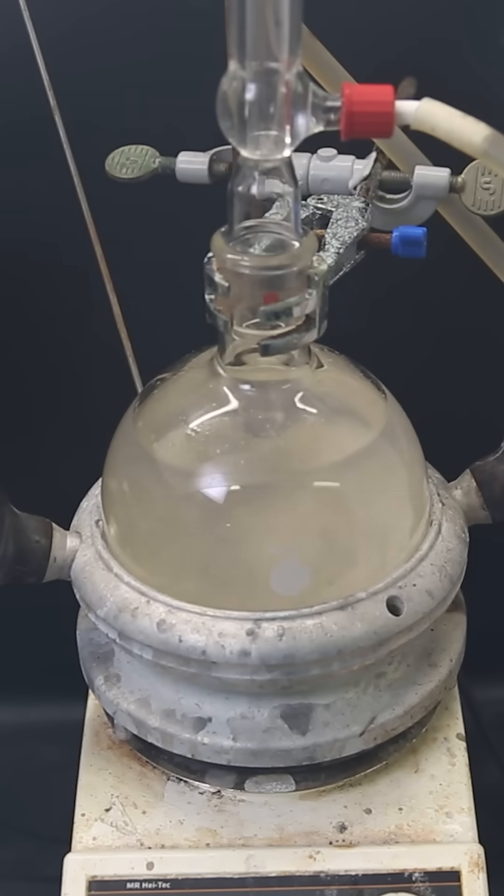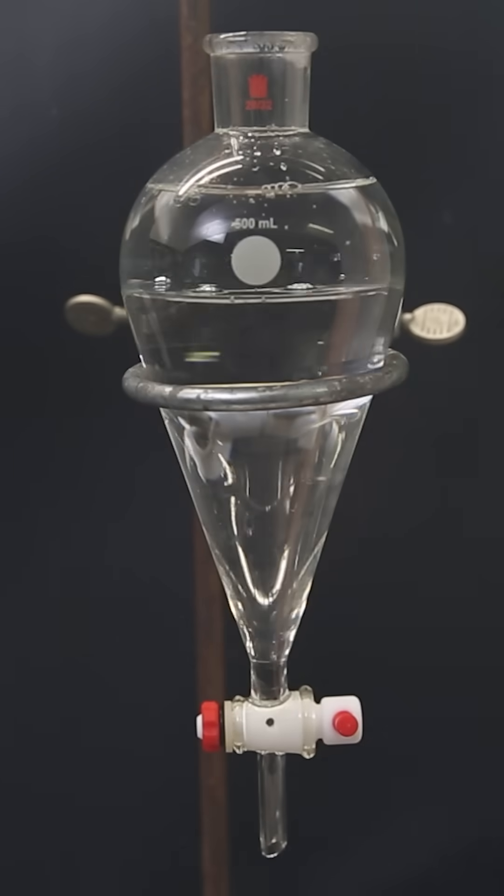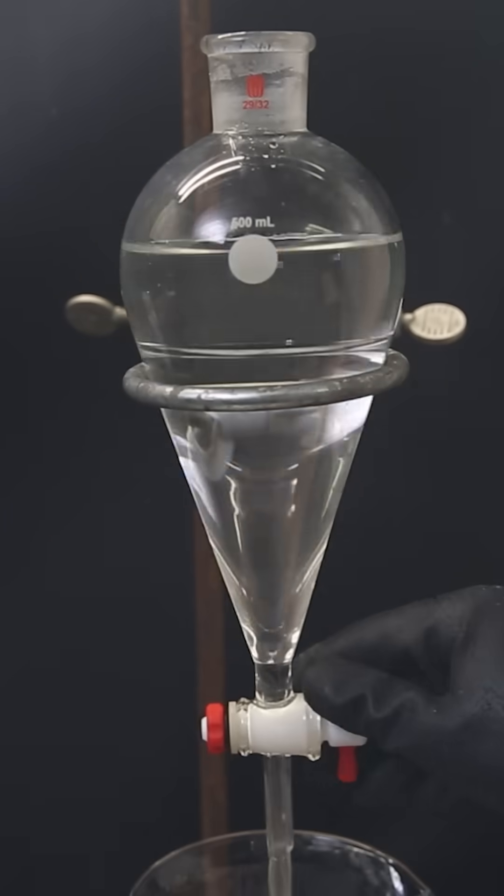After refluxing it overnight, the flakes have turned brown. I then move it to a separatory funnel and wash it with water to remove remaining potassium hydroxide.